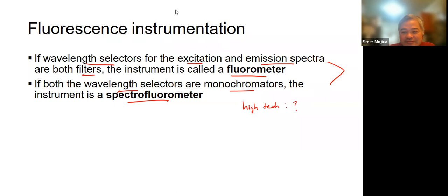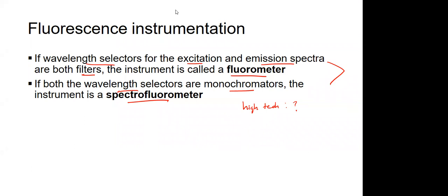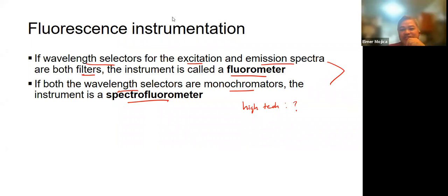Okay, what's the simplest filter that we have? Anyone? You can use it every day. Ano yung everyday filter na ginagamit usually natin? Yung shades natin. Okay? So when we use our shades, sometimes it cuts off yung shorter wavelength. Okay? Na meron tayo.